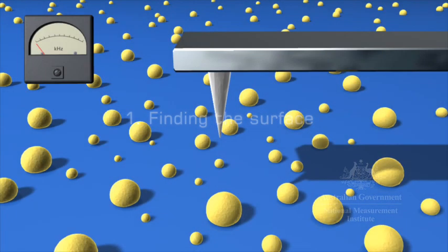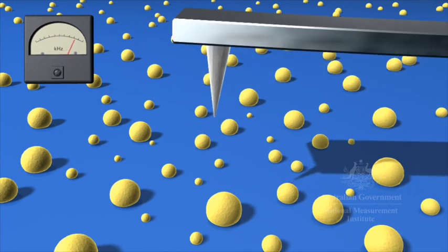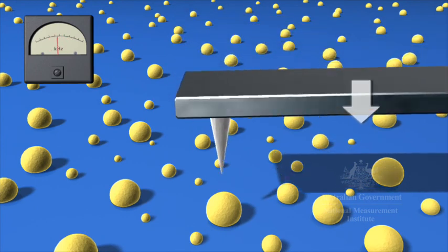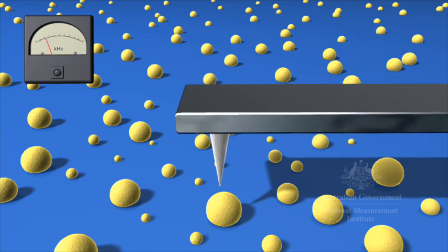The microscope's cantilever is activated to vibrate at resonance. As it is lowered, attractive forces between the tip and the sample alter the cantilever vibration.